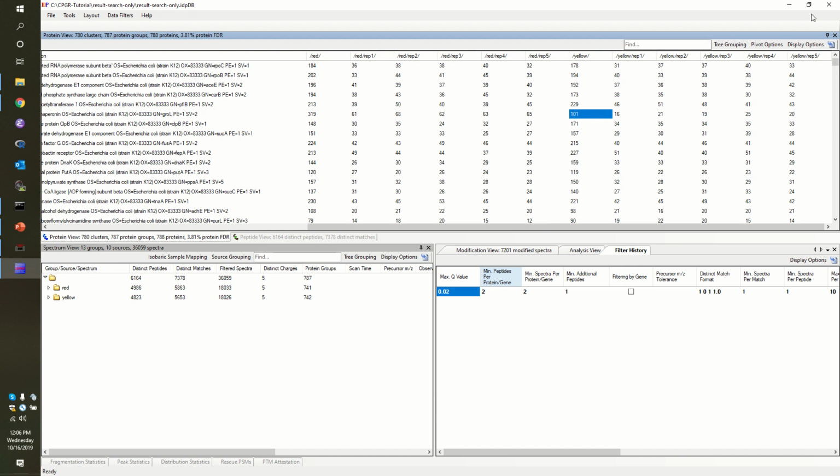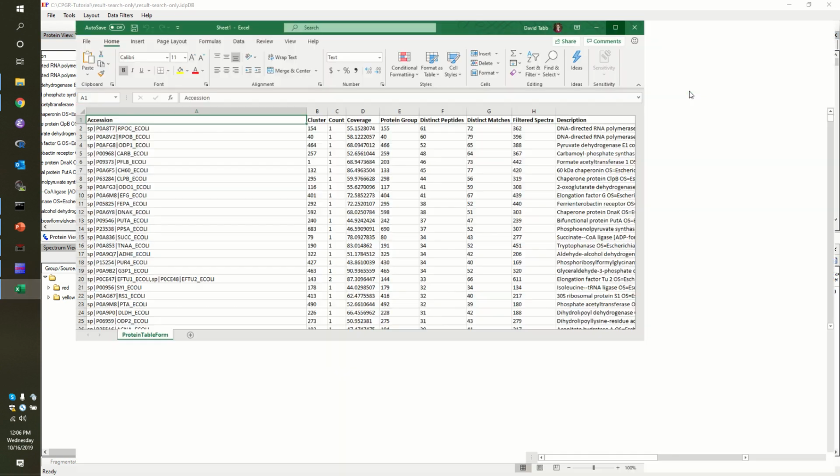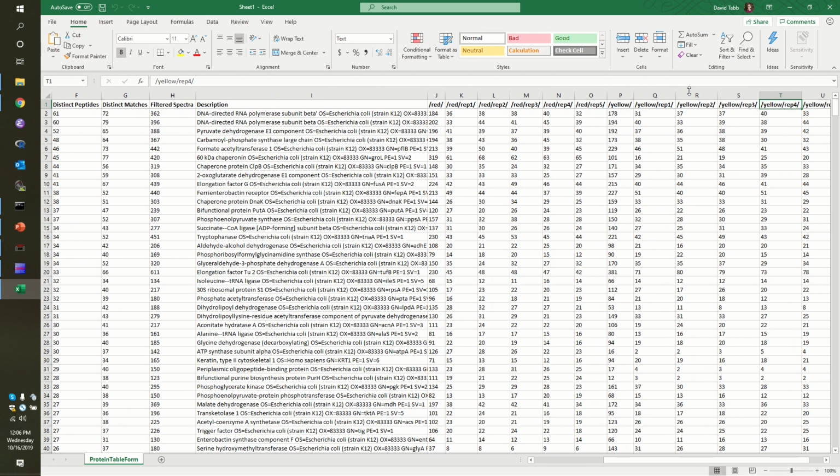This software, of course, is quite friendly in letting you dump off that result to R or even to your friend Excel. And you can simply open that table in Excel using the little export button in the upper right corner. You can see that after a moment, Excel is over here blinking saying, I've got this table for you. And there's your data. So we hope that software like IDPicker makes this a little easier to work with.